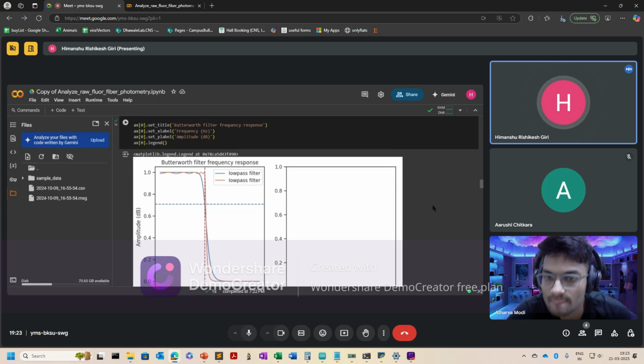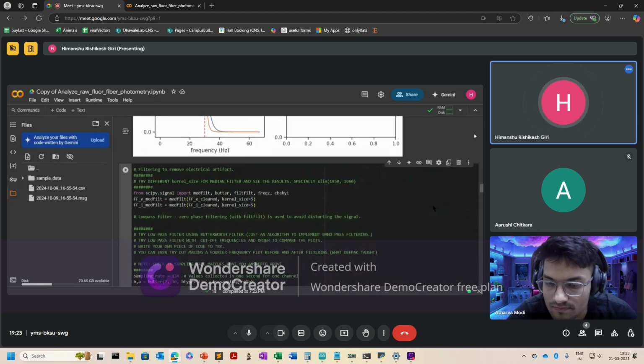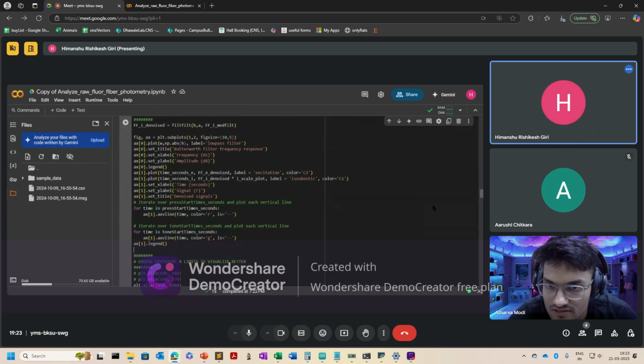Correct. Yeah, so you tried Chebyshev. Let's move ahead. Okay. No, Butterworth.